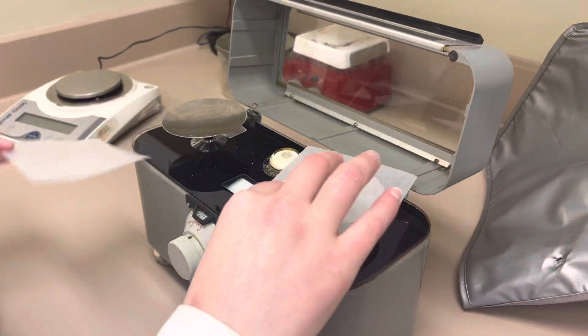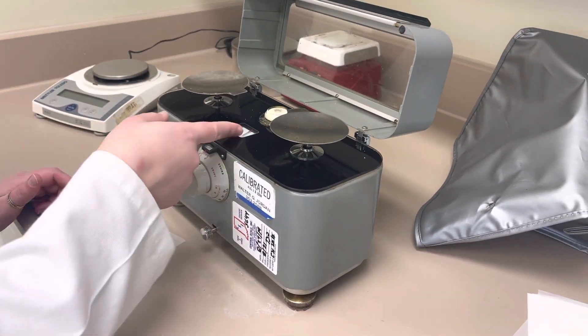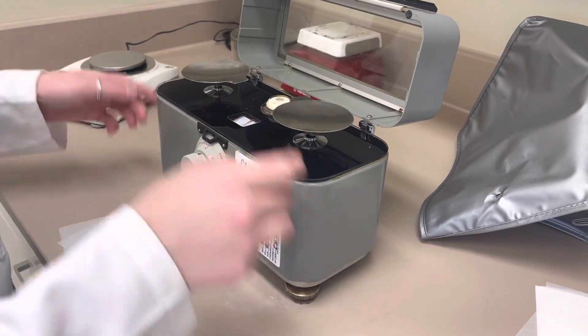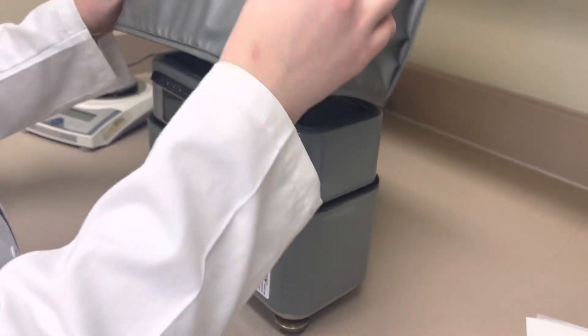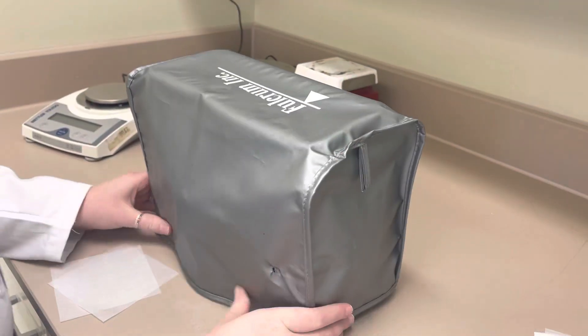After you're done, remove both of the weigh papers, lock it back so it's steady in the middle and can't move. Put the top down and then put the cover back on, and you're all done.